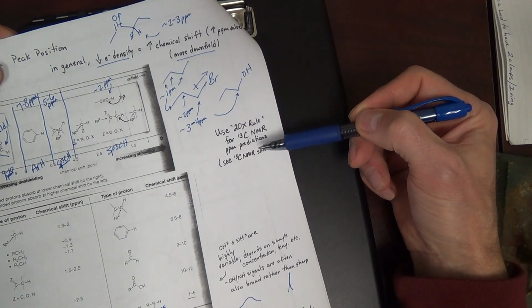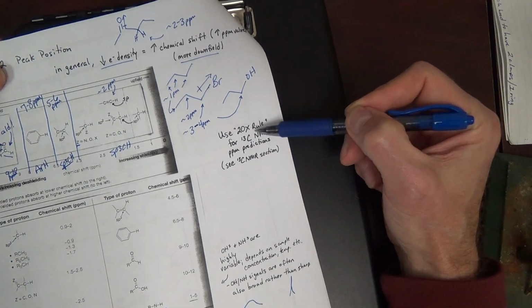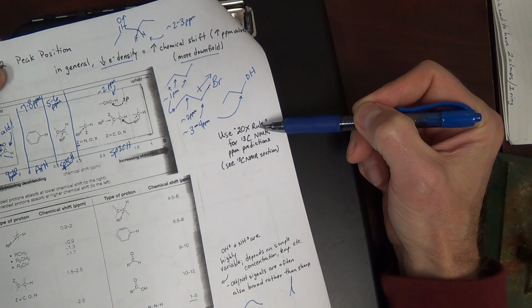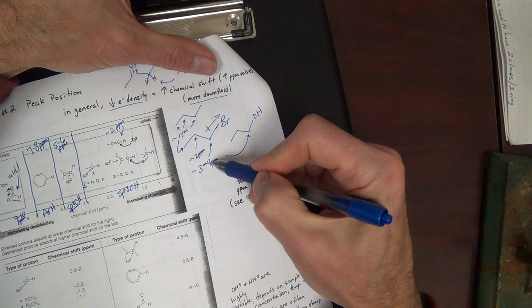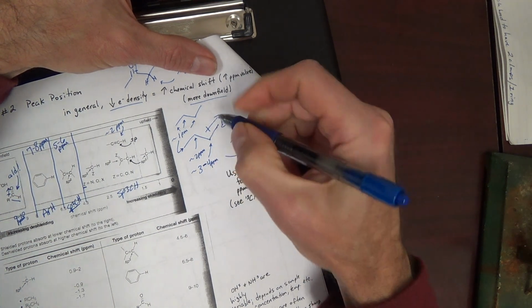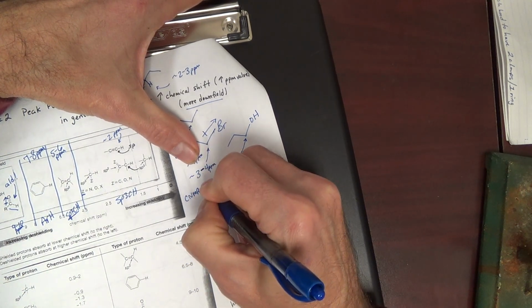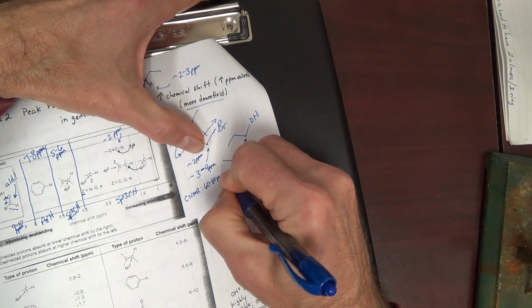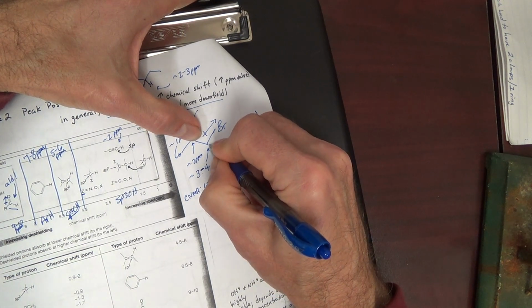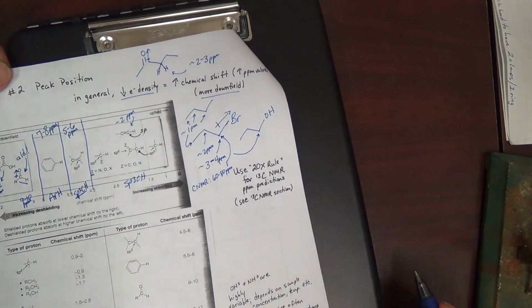Before we move on, I can make a comment about carbon NMR peak positions. Whenever you're looking at carbon NMR, we're going to use the 20 times rule. For example, the H on this carbon is about 3 to 4 ppm. Well, the carbon itself, in carbon NMR, it's just 20 times this. So it's going to be about 60 to 80 ppm for the corresponding carbon. And that's the so-called 20 times rule.